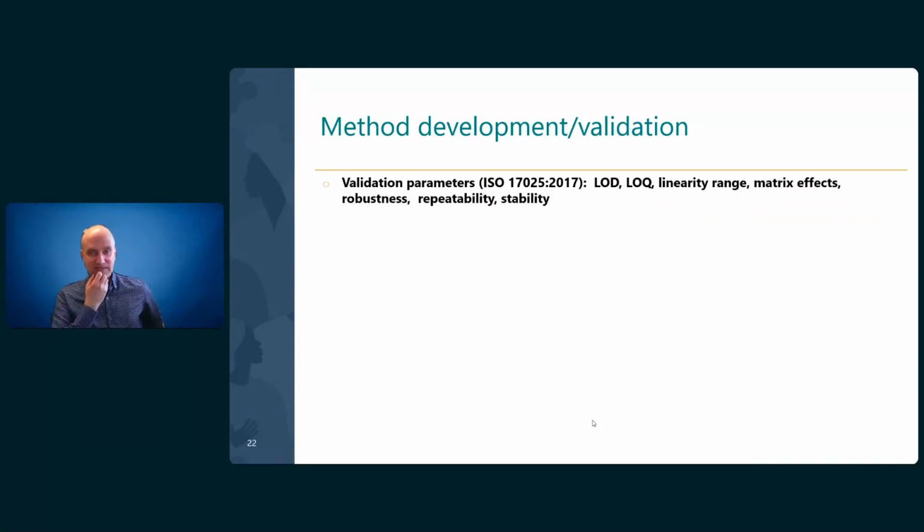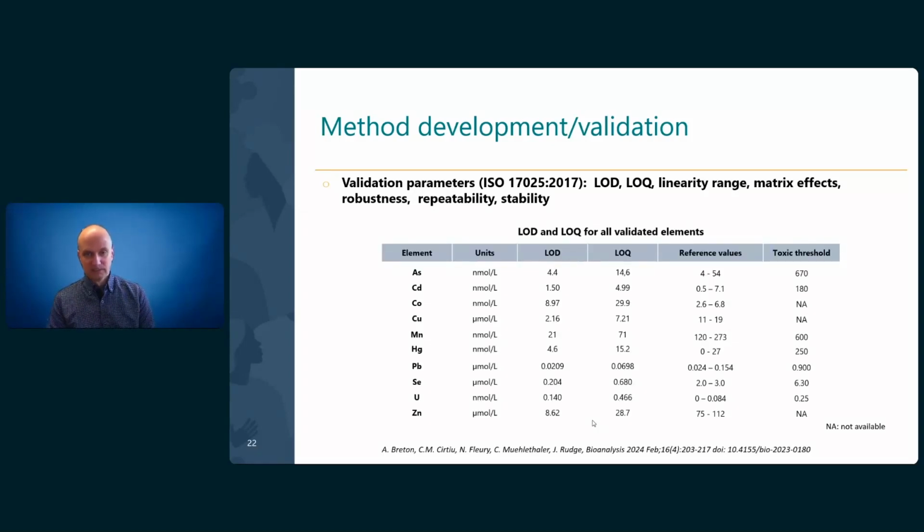Then we move to the validation of the method. As I said, our laboratory is accredited for ISO 17025, so we follow these guidelines for validation. So we did tests for LOD, LOQ, linearity range, matrix effects as well, robustness, repeatability, and stability over time at different temperatures. Let me show you here the method parameters.